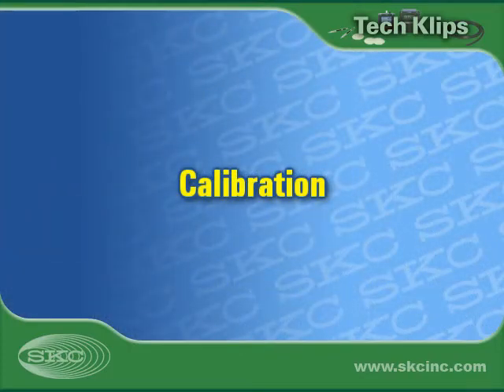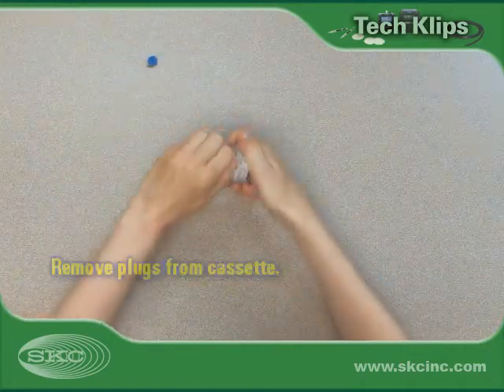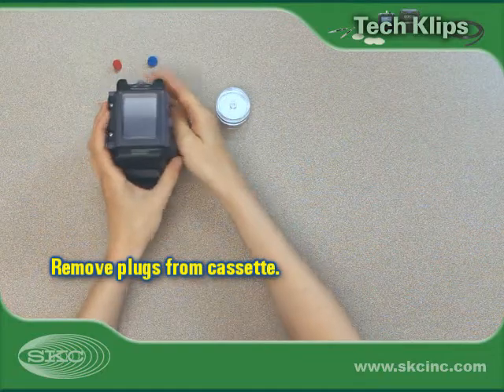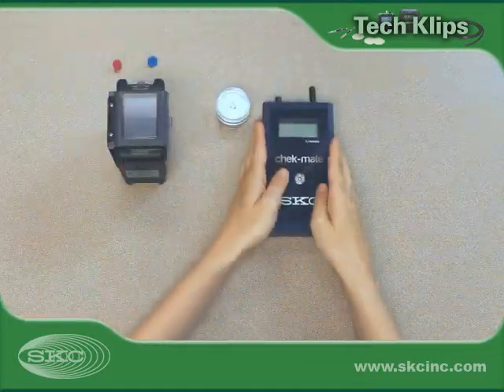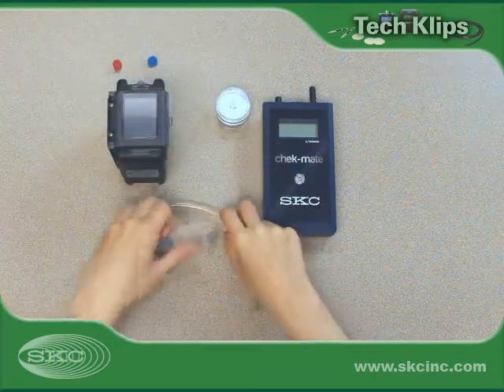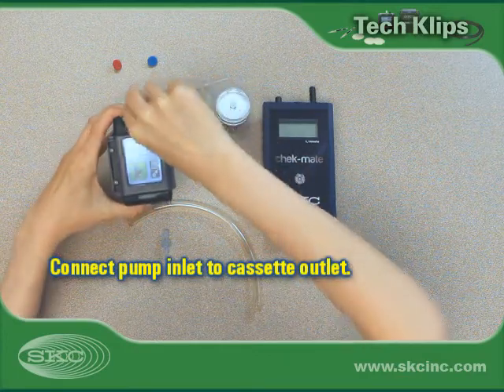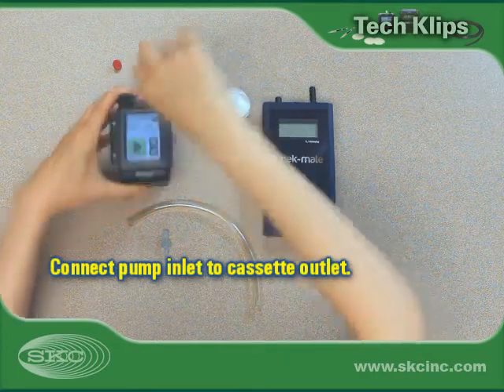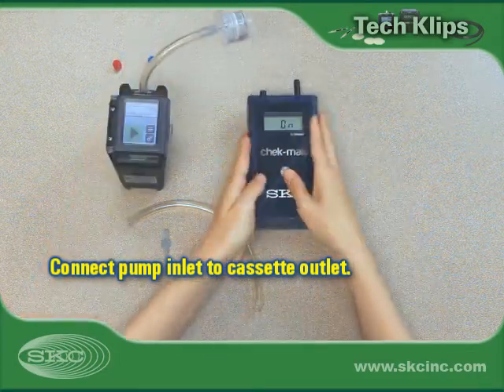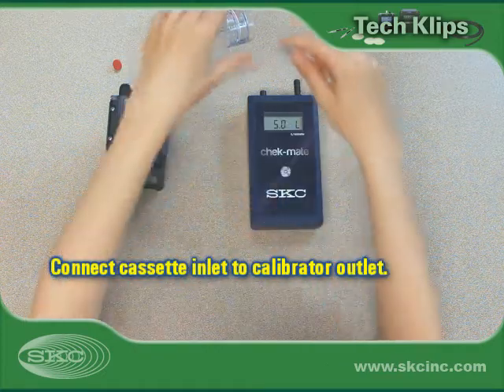Calibrate and verify pump flow rate before and after each sample. Remove plugs from the inlet and outlet of a cassette containing a filter representative of the type to be used in the field. Use flexible tubing and lure adapters to connect tubing to the cassette inlet and outlet. Use Tigon tubing to connect the pump inlet to the cassette outlet. Use a second piece of tubing to connect the cassette inlet to the calibrator outlet or suction port.